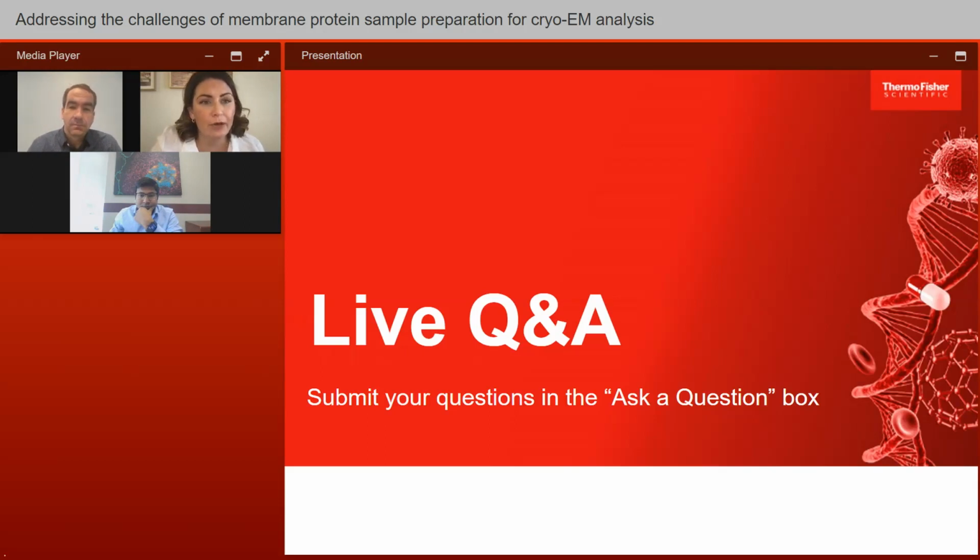Right. So for this screening platform, they screen the library using phage display. In this case, we reconstituted into biotinylated nanodiscs so that we can immobilize them on the plate. So you need some sort of biotinylation there to immobilize it. They have also done it in biotinylated amphipol, and you can use that as well.